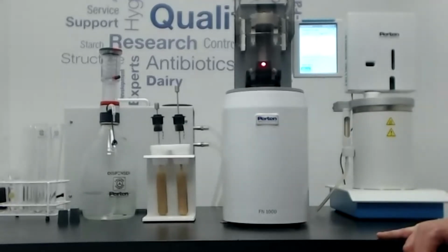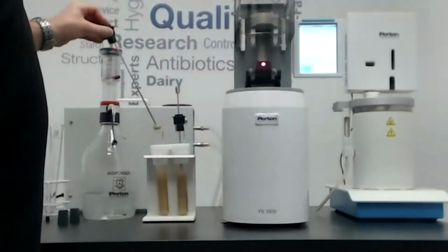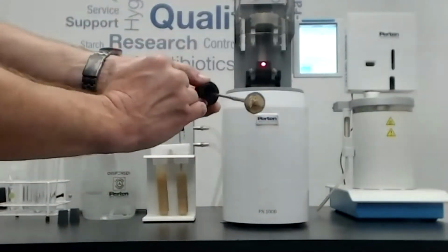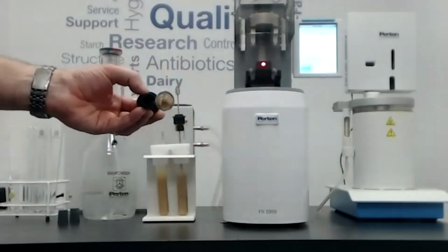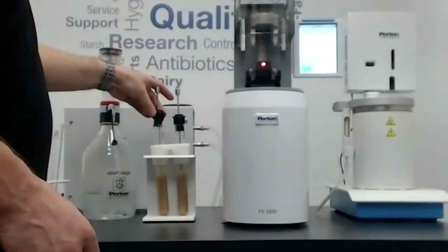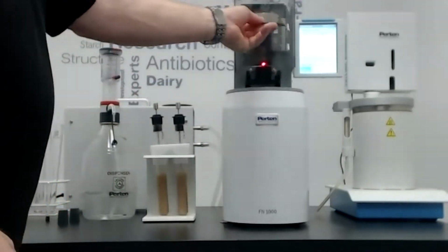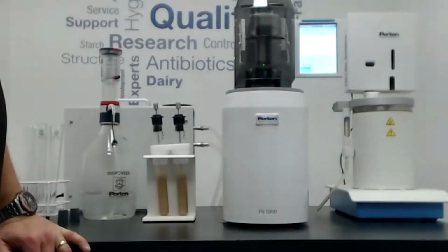The stirrers need to be cleaned properly. What you need to ensure when you're cleaning these stirrers is that you make sure you clean around the end as well. You don't want any material stuck up there. So that's a demonstration of the new Falling Number 1000.